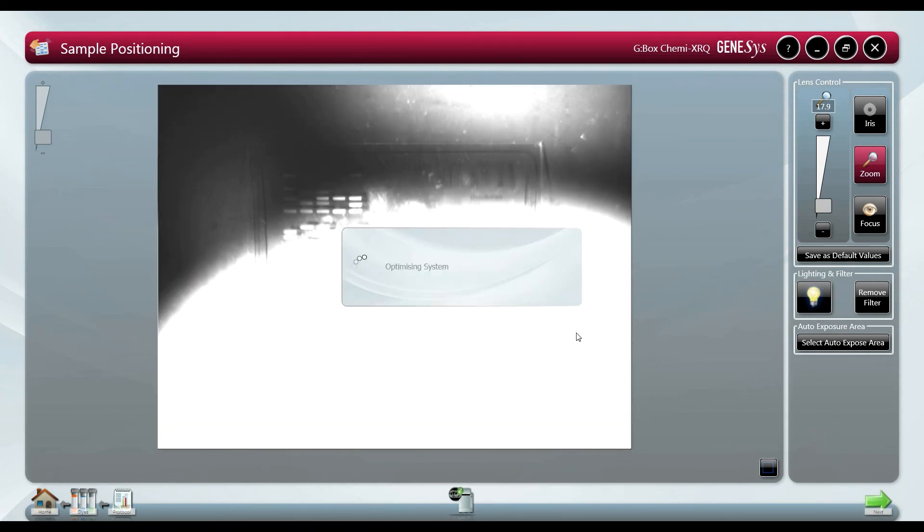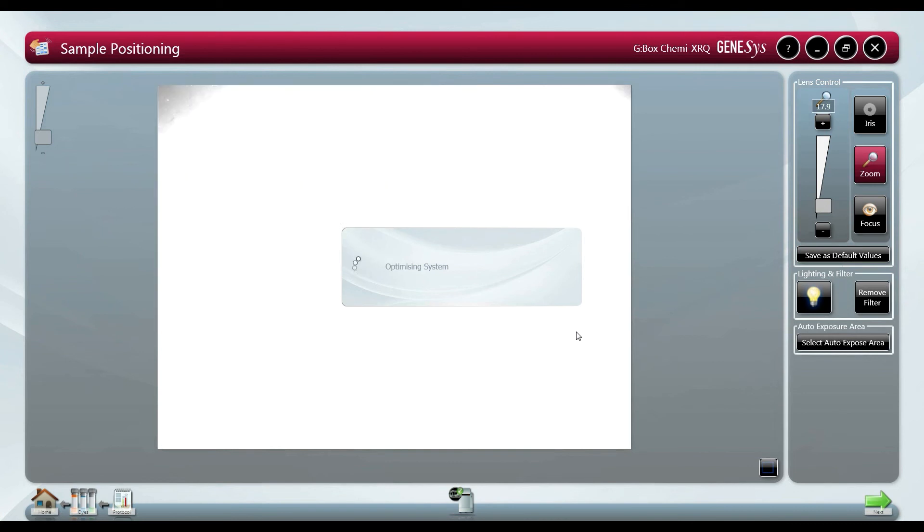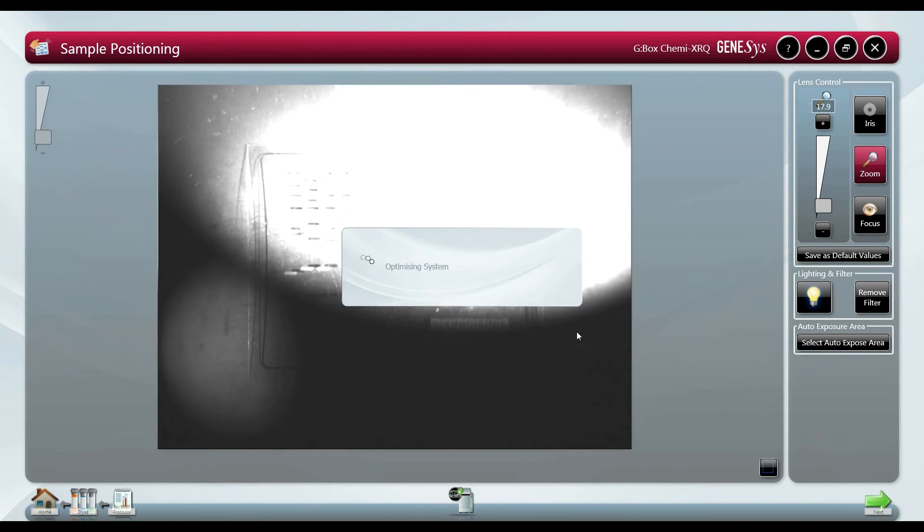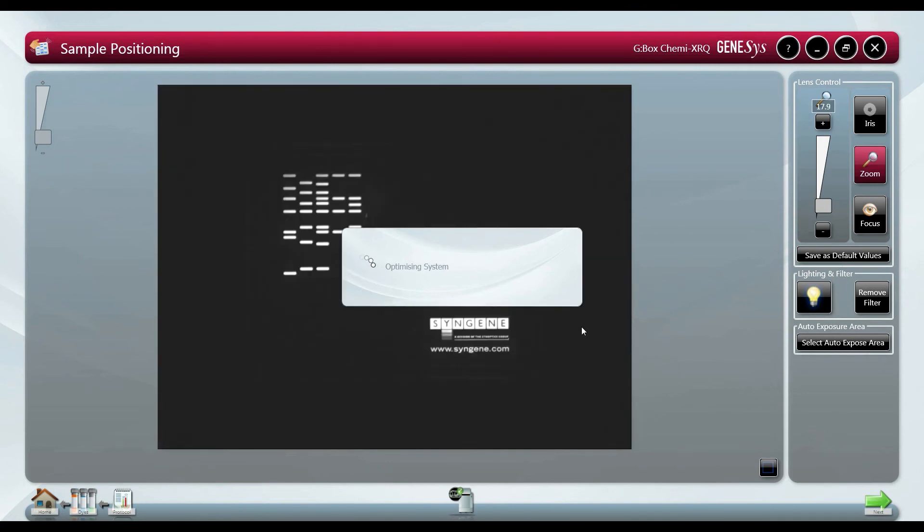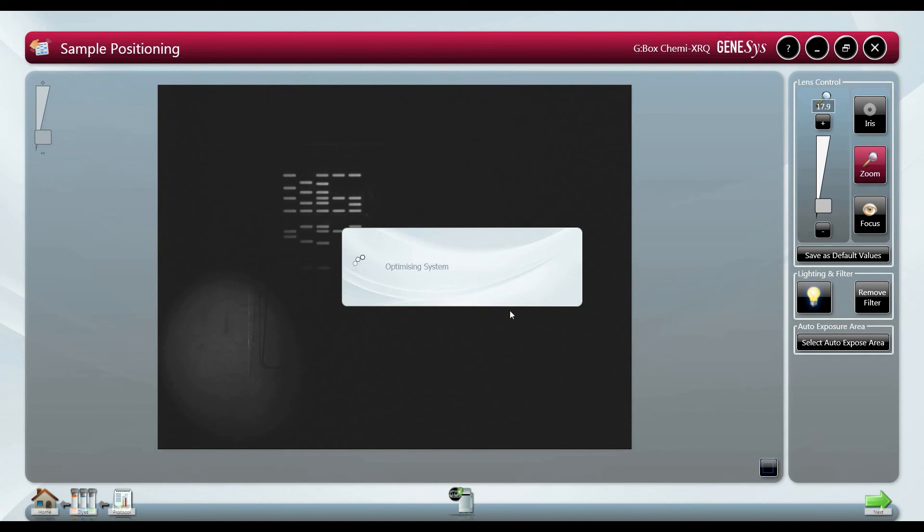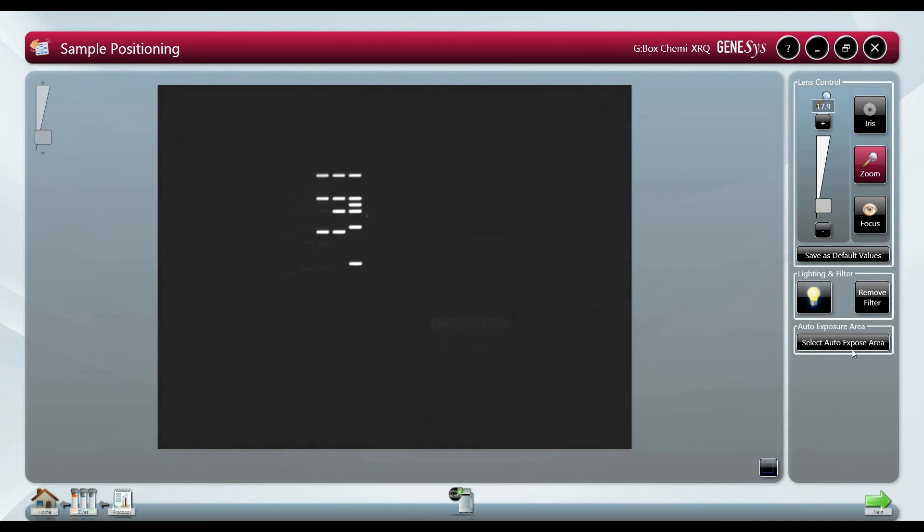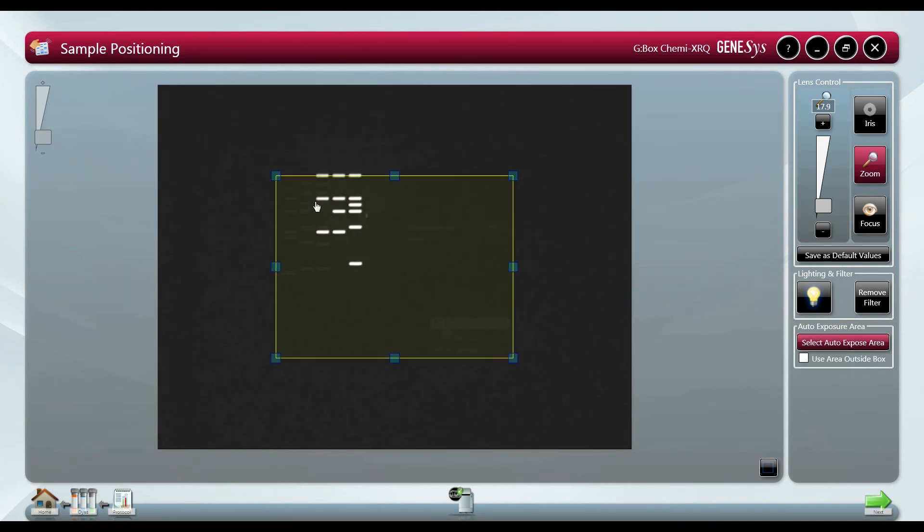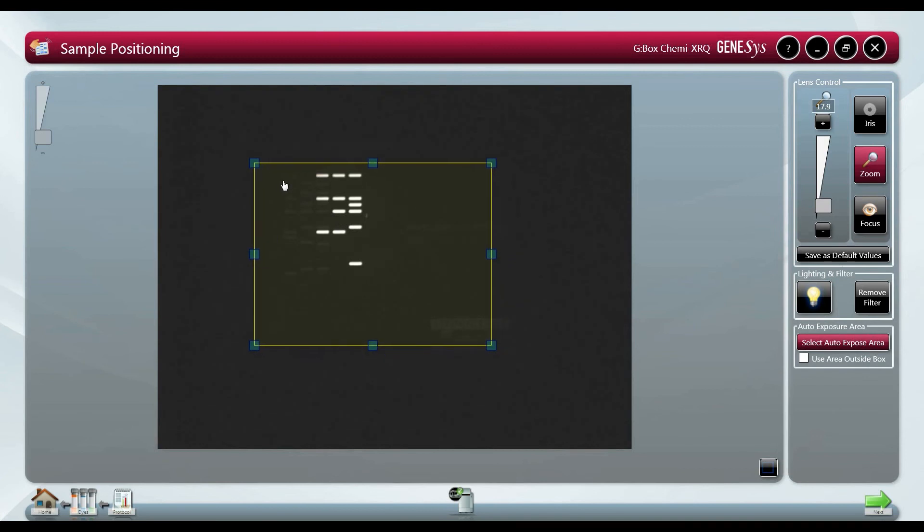Auto expose area is a powerful feature to use if you have both bright and faint bands on the same blot. We can either select the faint bands to optimize the signal they produce or we can select the area outside the brighter bands to ensure the faded ones show up.